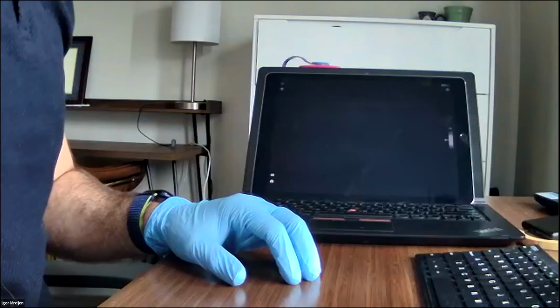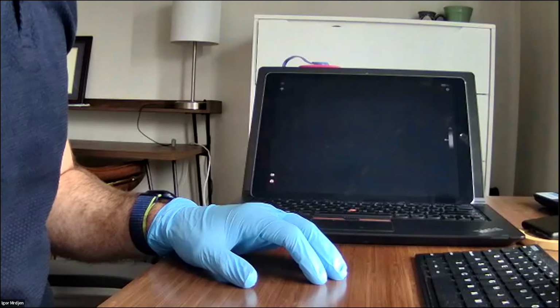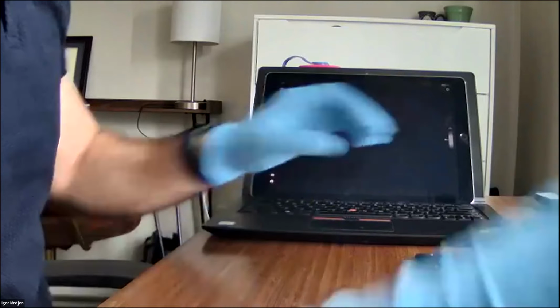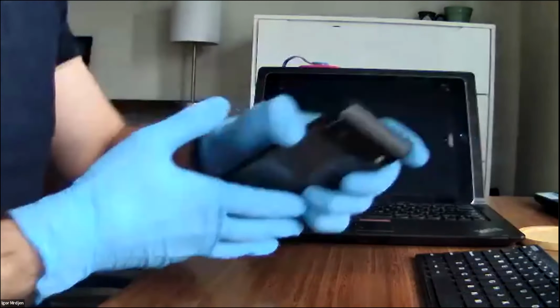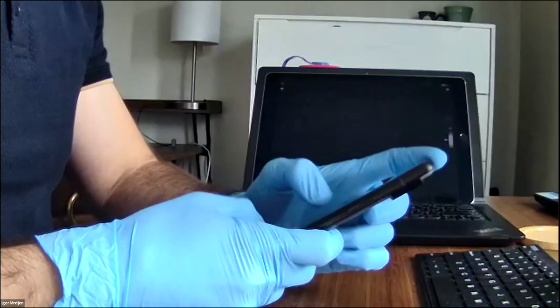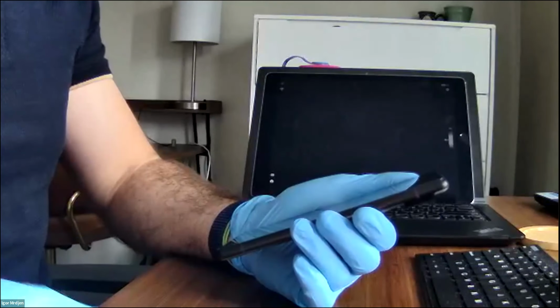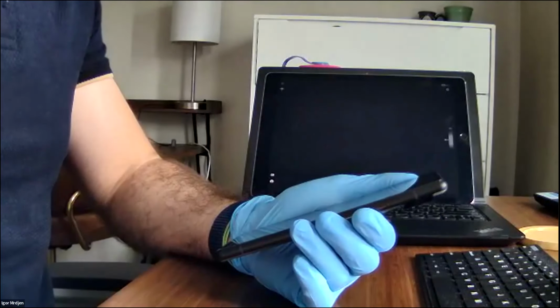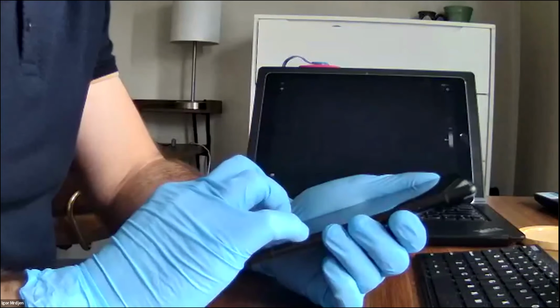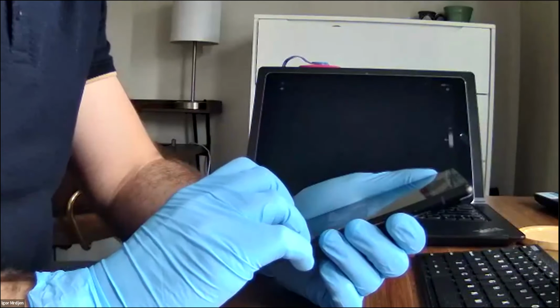One question that came in, Igor, is the sample from a plankton tow that would concentrate the algae, or is it a simple grab? It is just a grab sample. Like I said, this lake that we sample from is very densely blooming. In fact, that first image I shared on the presentation of that really heavy bloom was yesterday when I collected the sample. So it is not a tow.